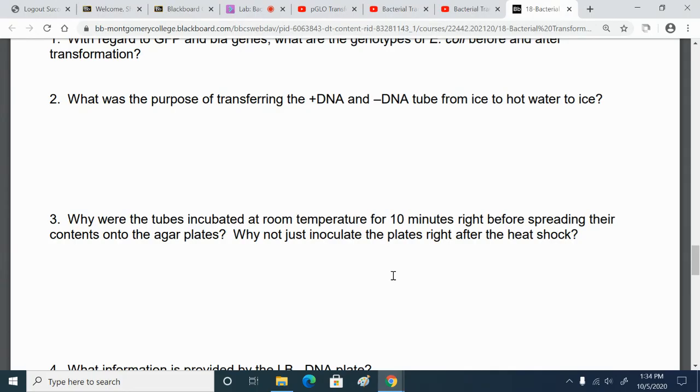So they are doing something. They're not growing, they're not dividing, not in 10 minutes, but they are doing something very important. And we need to give them time to do it, and nutrients, because remember, they're just in calcium chloride. There's no other nutrients there. So we give them some nutrient broth so they can begin to do something.